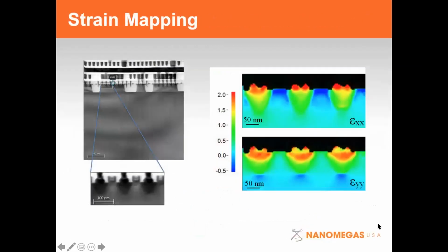And then I'll talk very quickly about some of the other things we're doing. So we have strain application. Strain works very similar to the orientation in that you're matching an acquired diffraction pattern to another data set. So in the case of orientation, it's a generated template. In strain, it's an unstrained area of your sample.